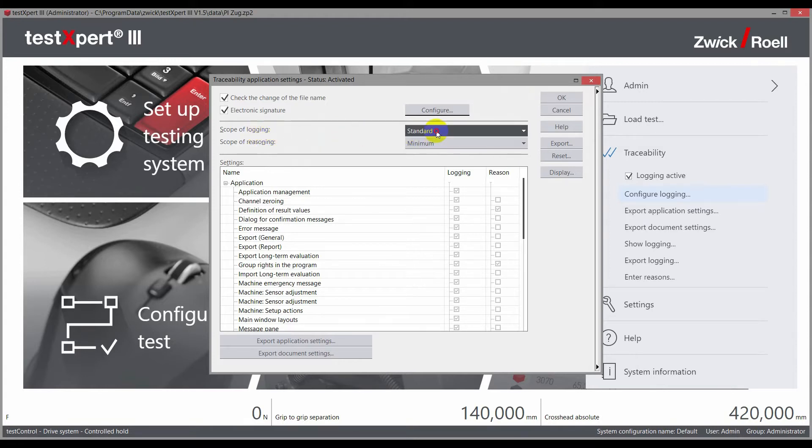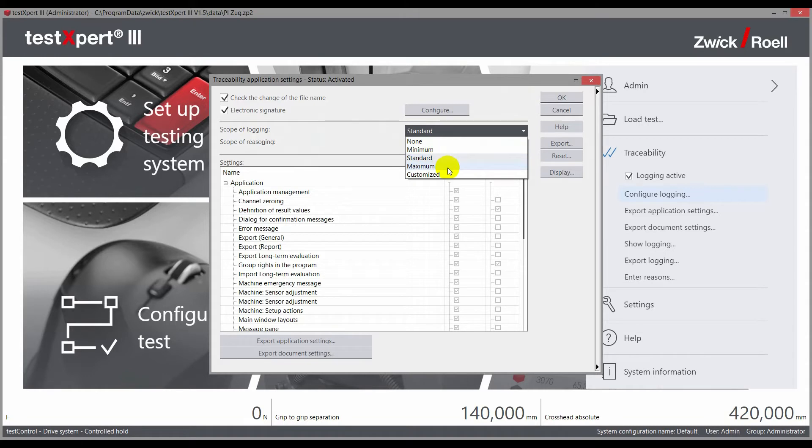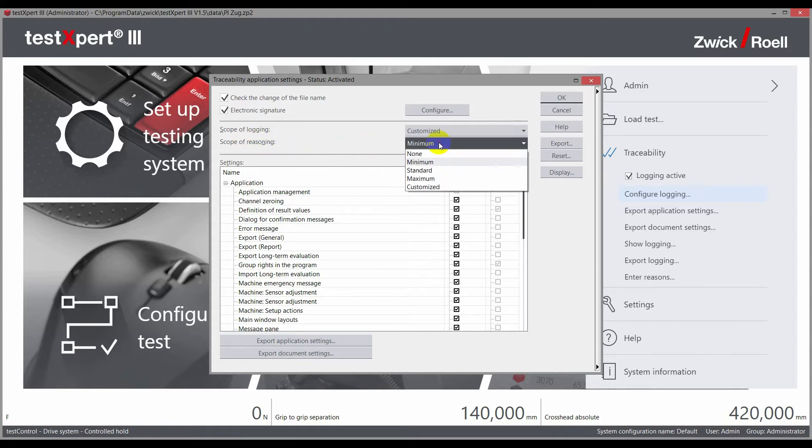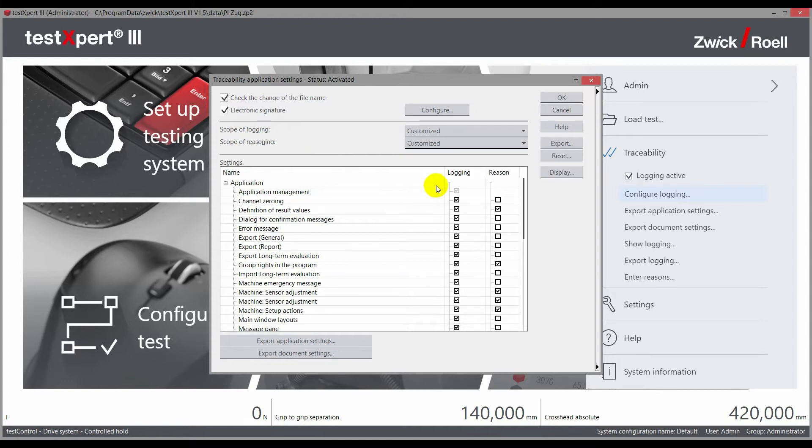TestExpert 3 has predefined levels for logging and the request for reasons, which in most cases are sufficient to achieve various levels of security. Beyond this, the administrator has the ability to freely define both levels.